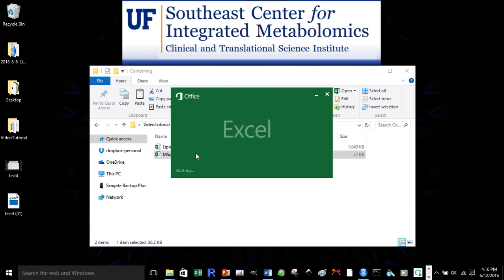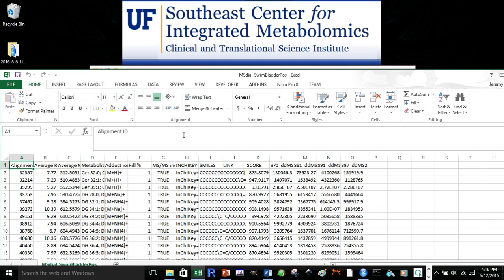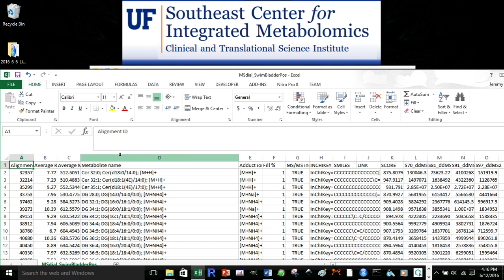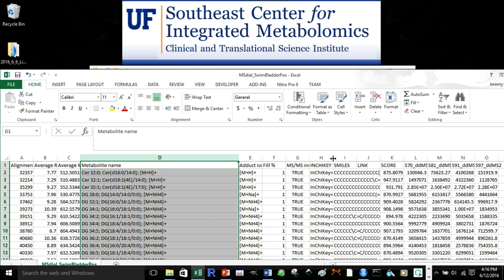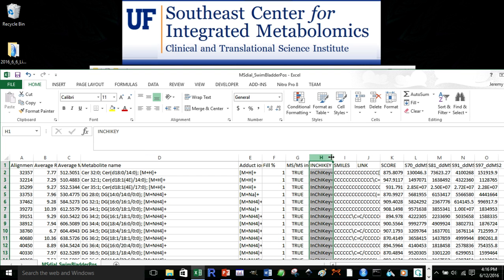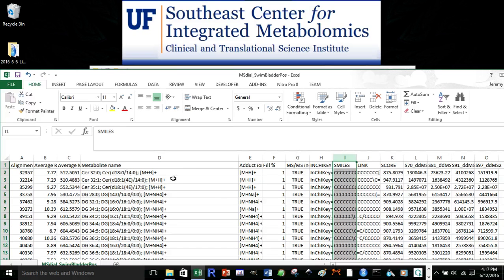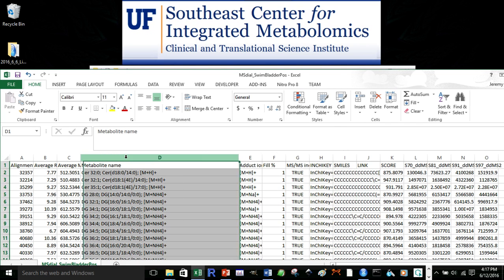Now we'll open up our MSDial file, and in our MSDial file, we'll see the same types of columns that we want to write down. So first, for our identification, we have multiple options. We could take the metabolite name, we could take the InChIKey, we could take the SMILES, or using a concatenate function in Excel, we could combine them all and append all of them to the lipid match file. In this case, let's just take the metabolite names.